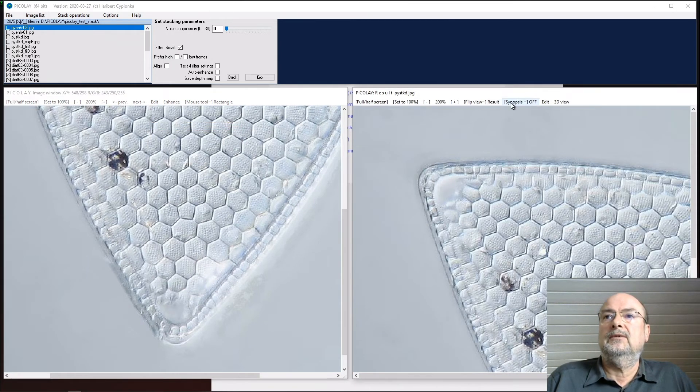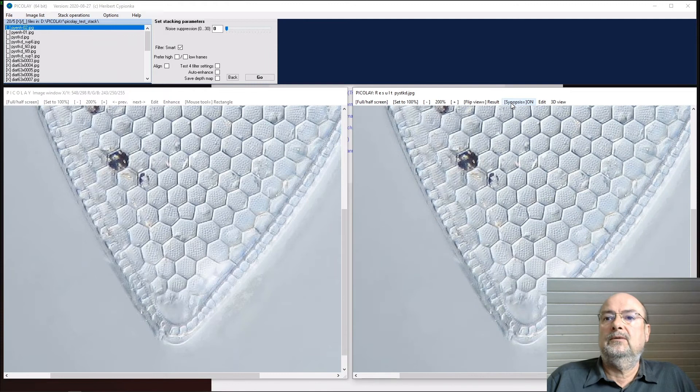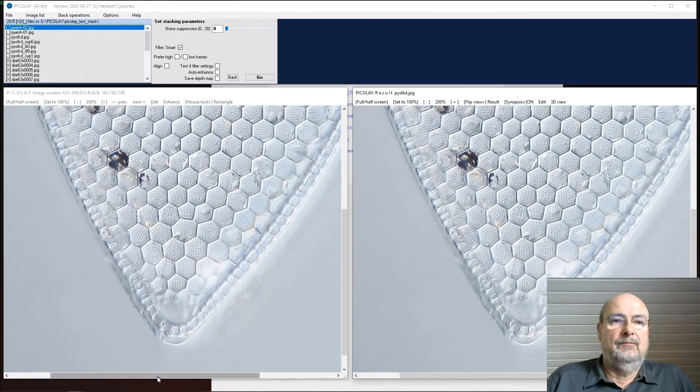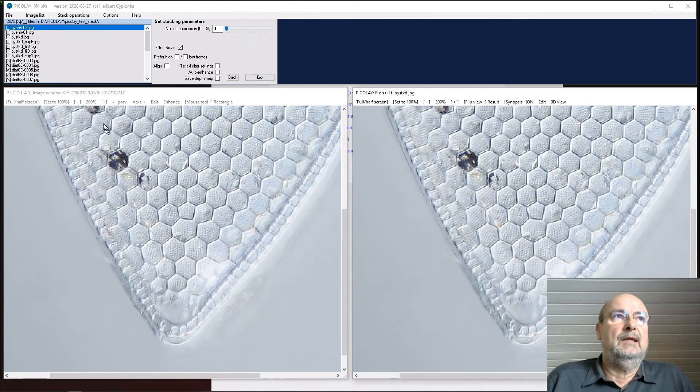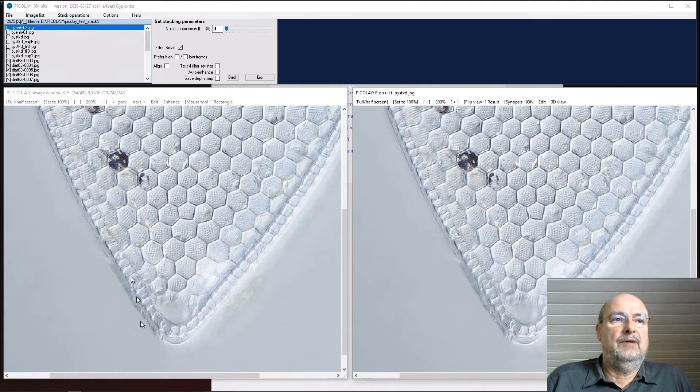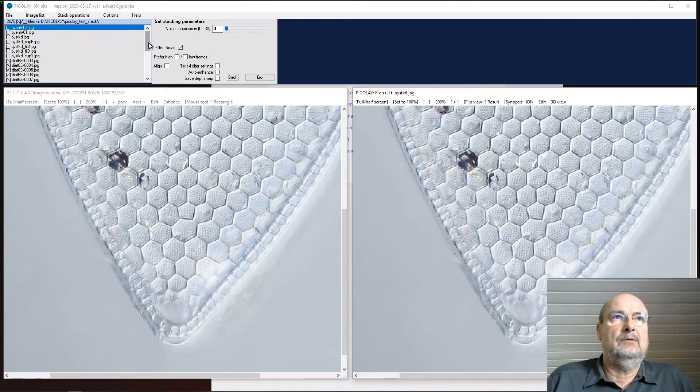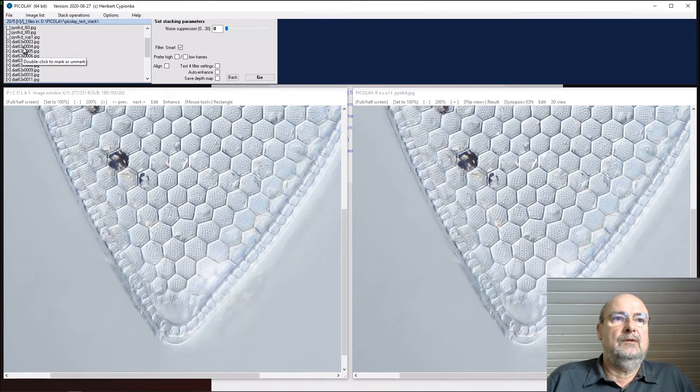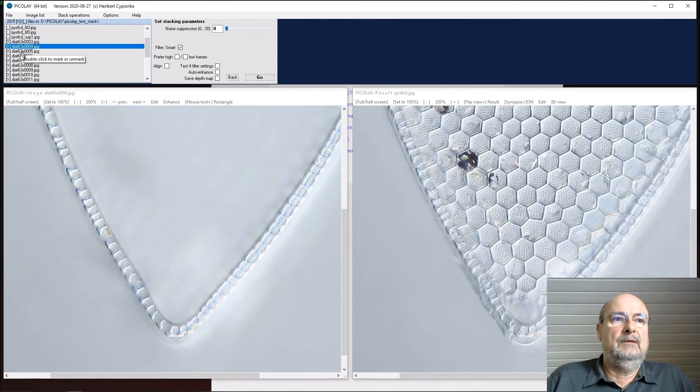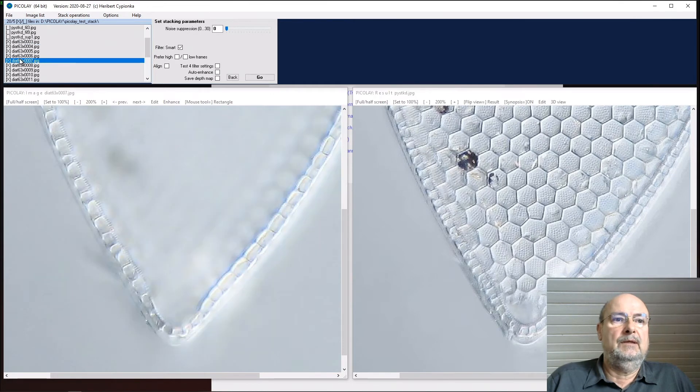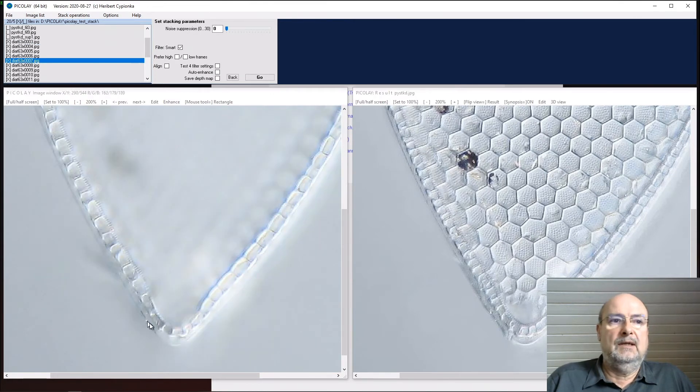And then we say synopsis on to get the same field of view. Now I could try to find these structures here in my original pictures, going along here. And you can see okay, here we have this structure.